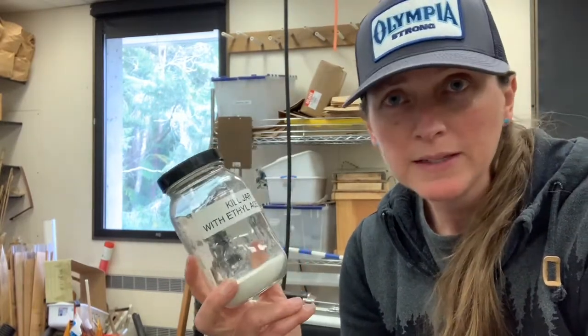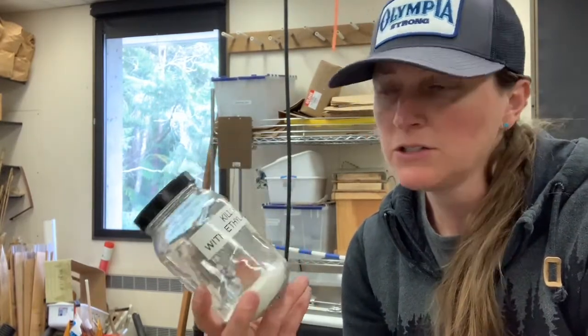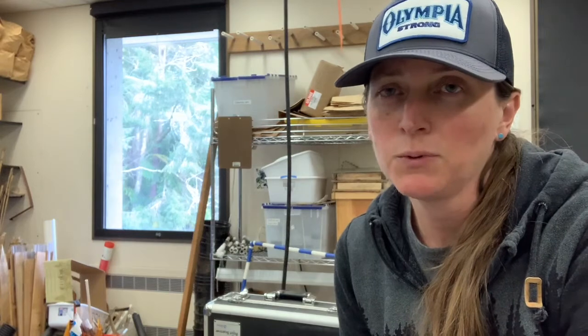If you're doing aquatic insect collections, you don't need a kill jar because the insects are already wet and used to being in wet environments. The best way to kill and preserve aquatic insects is in ethanol, methanol, or isopropyl alcohol. One of the simple alcohol types you can find in the grocery store will work. Isopropyl, or if you're using lab grade, you might use ethanol. You'd want to use an ethanol that's been diluted to about 70 to 80 percent to maintain osmotic regulation so that you don't dry out the organisms in your alcohol.